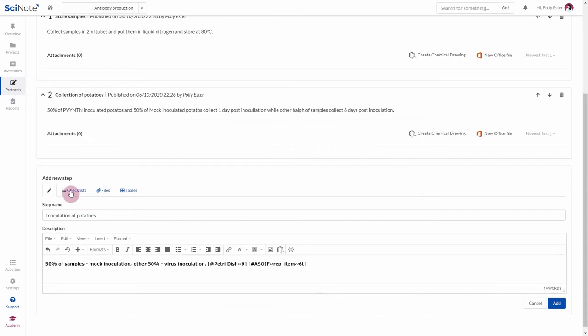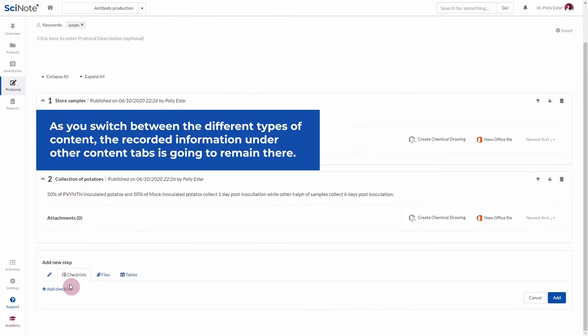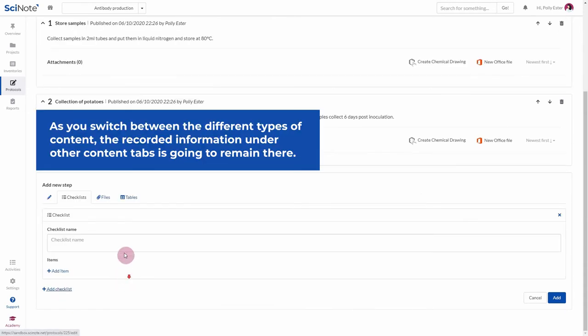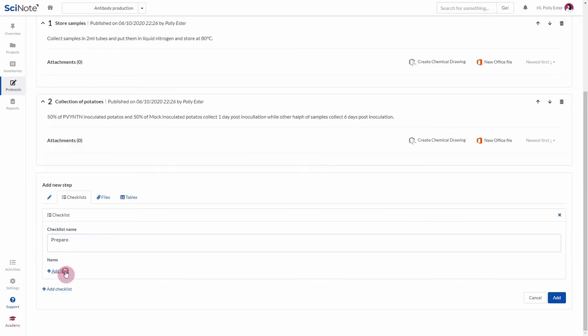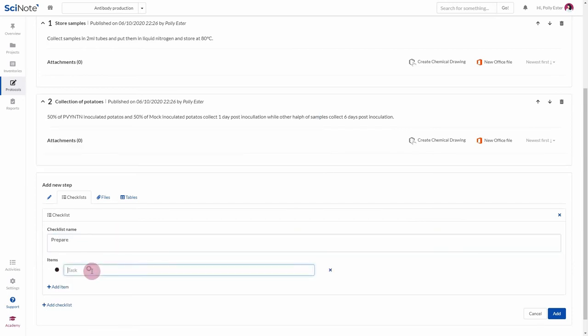Then there are checklists. Let's add one. After naming it, you can start adding items. You can add several checklists to the same step.